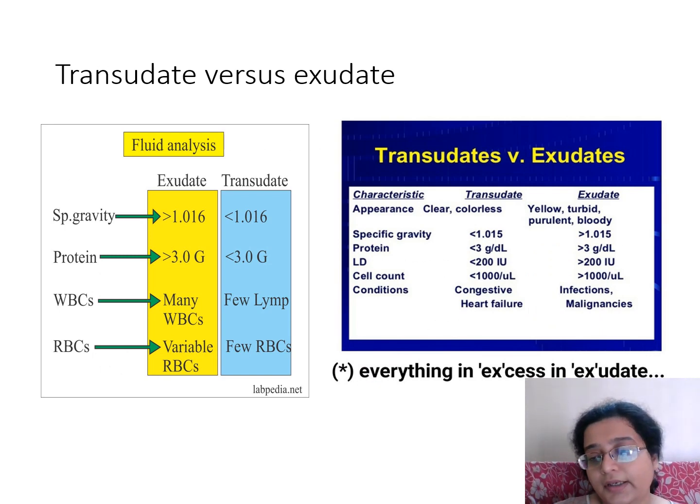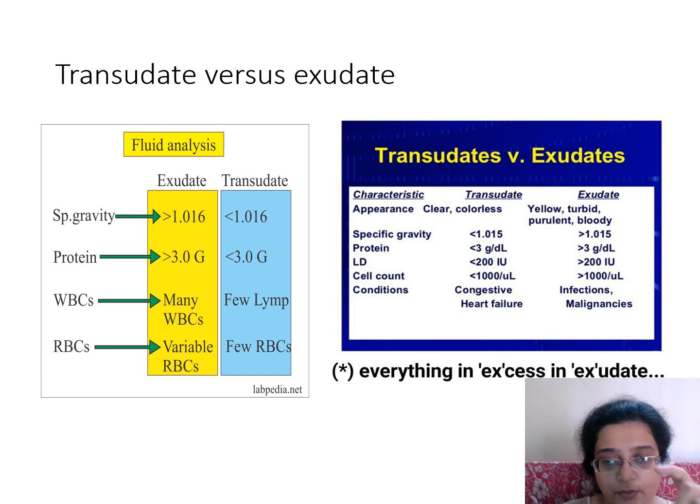Most importantly, clinically, when we get a fluid, we examine it grossly. I'm going to take it further: what is the color, what is the transparency, is there coagulum or not, is there blood or not, what is the volume. These are the headings.